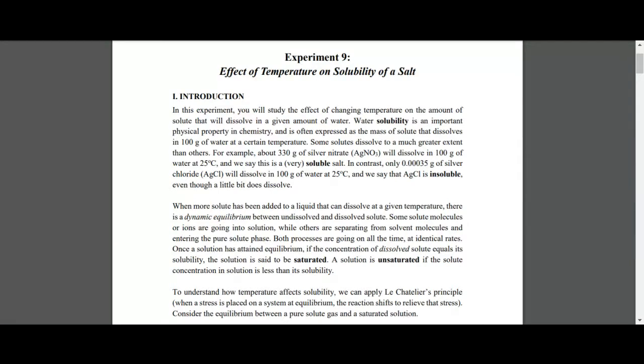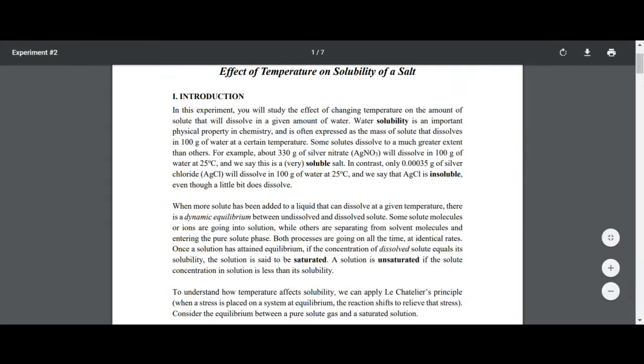So you can put more solid, which is called the solute, into the solvent to make a saturated solution at high temperature. When you lower the temperature, the excess amount would come out. So let's look at the explanation for the experiment first, and then we get to the point that we have to deal with the pre-lab questions as well.